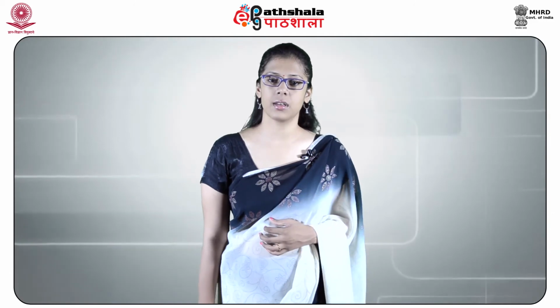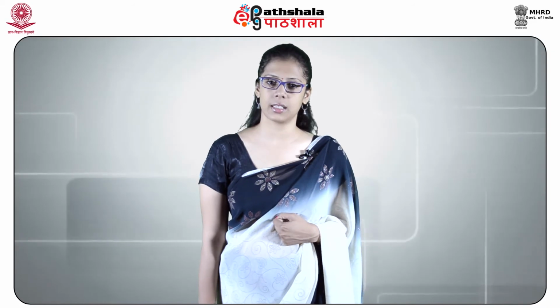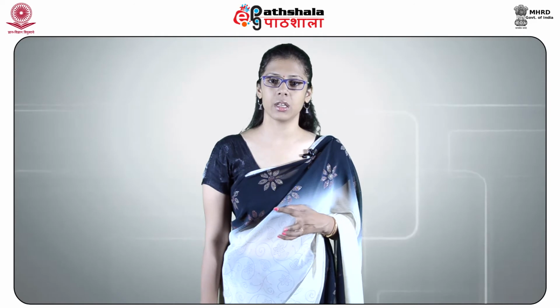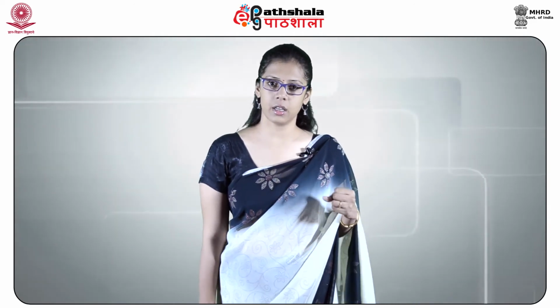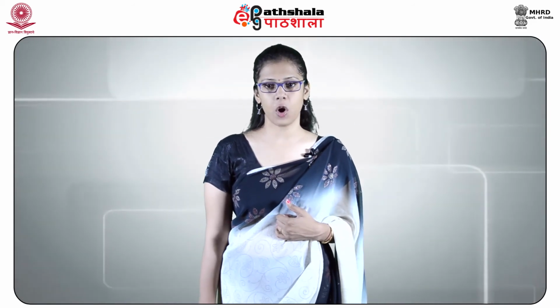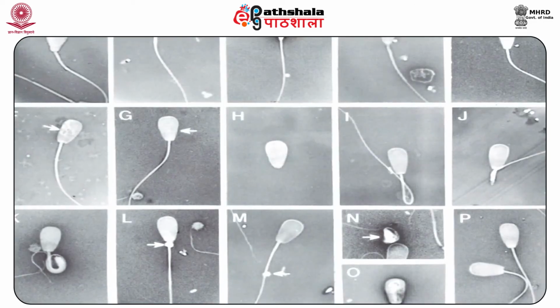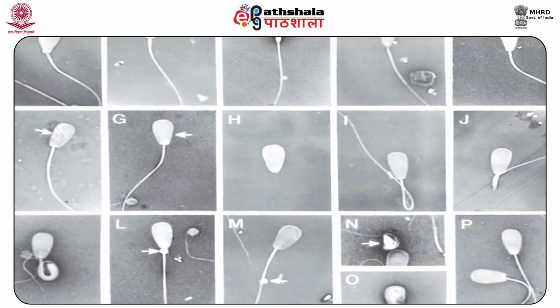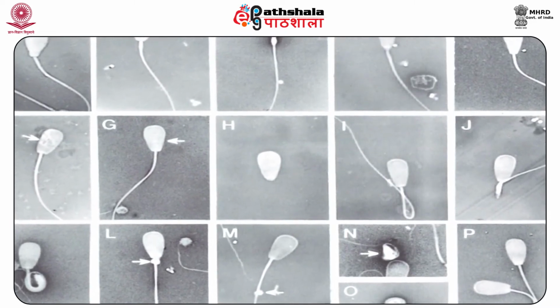This test was discovered by Dr. Florence in the year 1886. When Florence reagent, that is potassium iodide, iodine plus water, is applied to the slide, it produces rhombic shaped dark crystals of choline periodide. Similarly, any tissue or biological material containing sufficiently high choline concentration would give a positive Florence test.